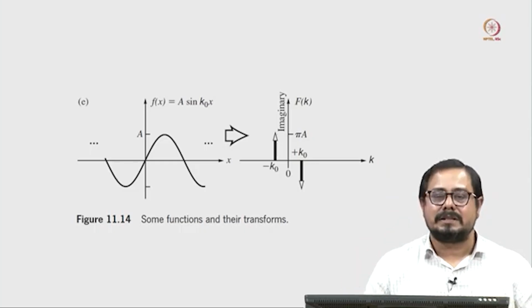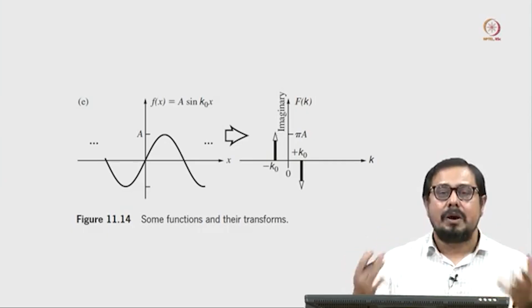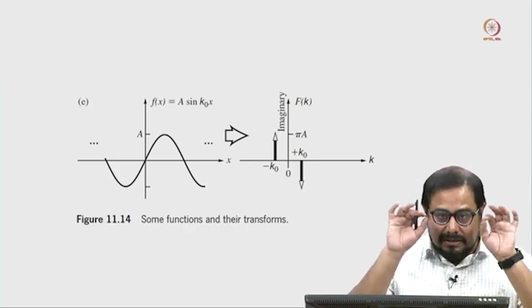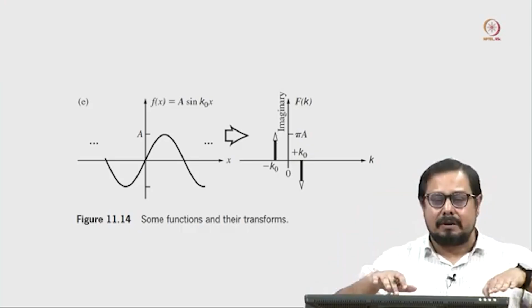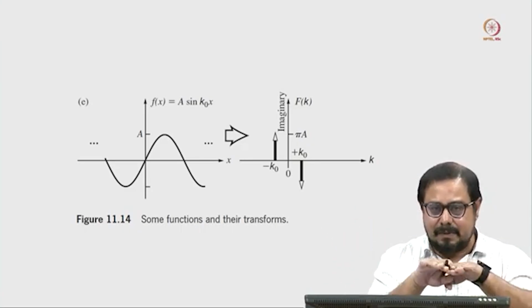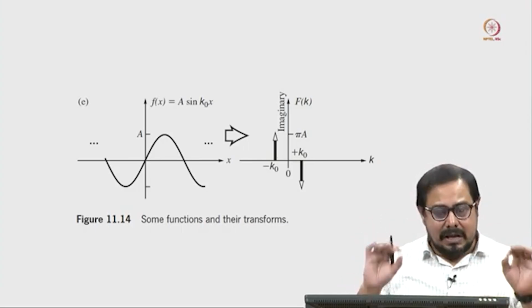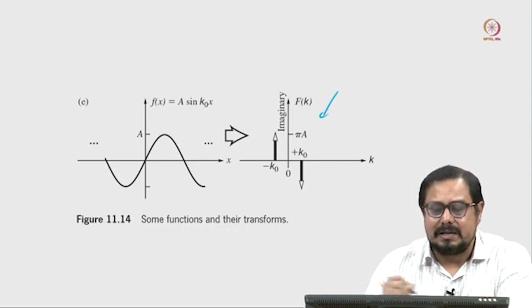I already discussed the back focal plane. Back focal plane is the first plane where we will get the images. What kind of images will we get? We will get the images of the diffraction pattern of our sample. So, back focal plane is the first imaging plane in our electron microscope, where we are going to record the diffraction pattern.